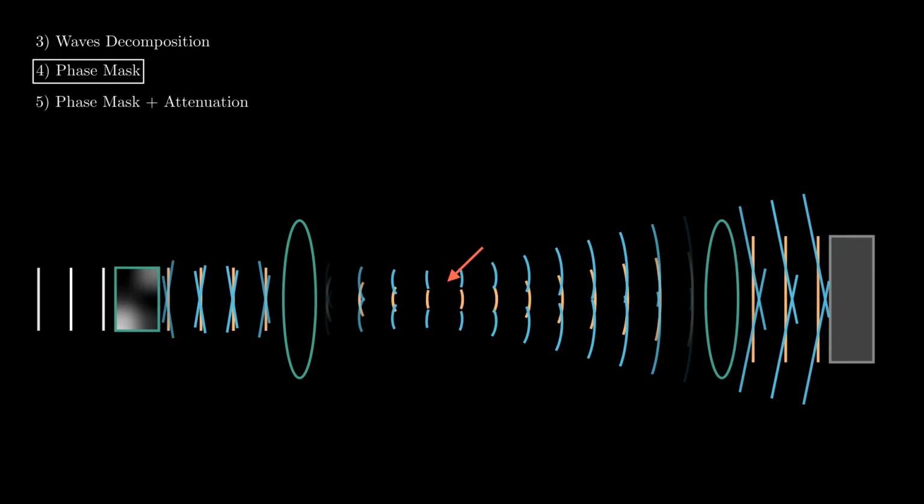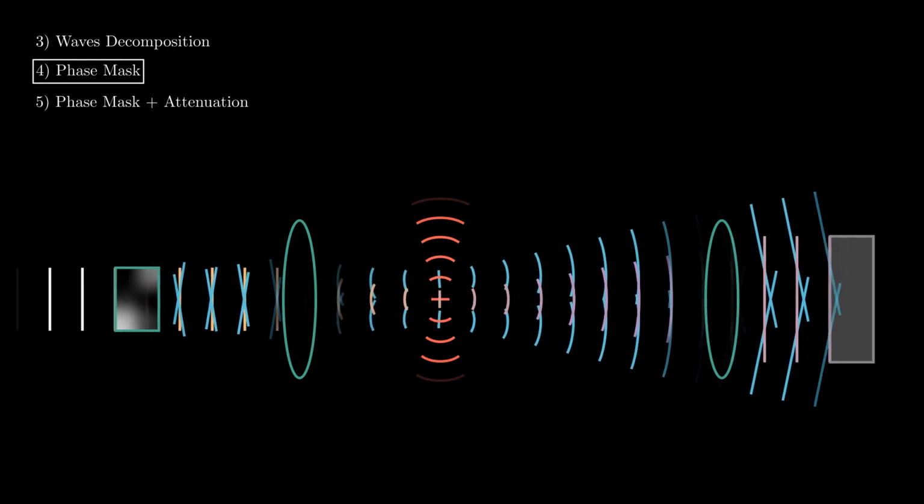It is now time to introduce our solution to the problem, the laser phase plate. By placing an intense laser right at the focal point of the lens, we can shine laser almost purely on the orange unperturbed wave. Electron components that go through a laser experience an effective higher potential energy, and therefore travel slower than components of the electron wave that pass by the laser. This adds a relative phase shift to the unperturbed wave. The phase-shifted unperturbed wave is drawn in purple.